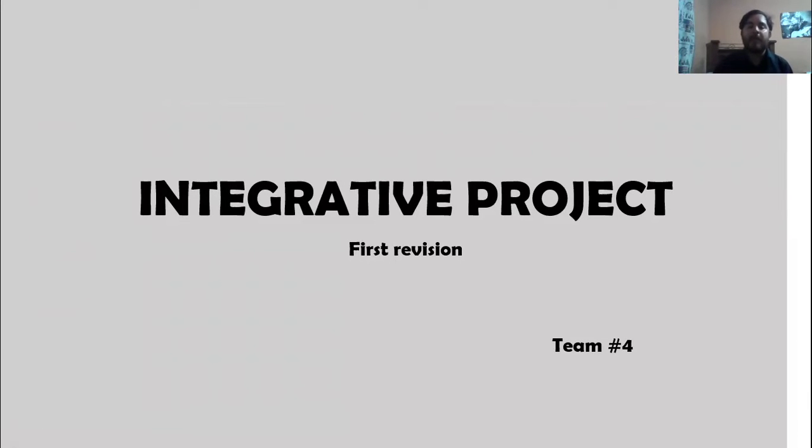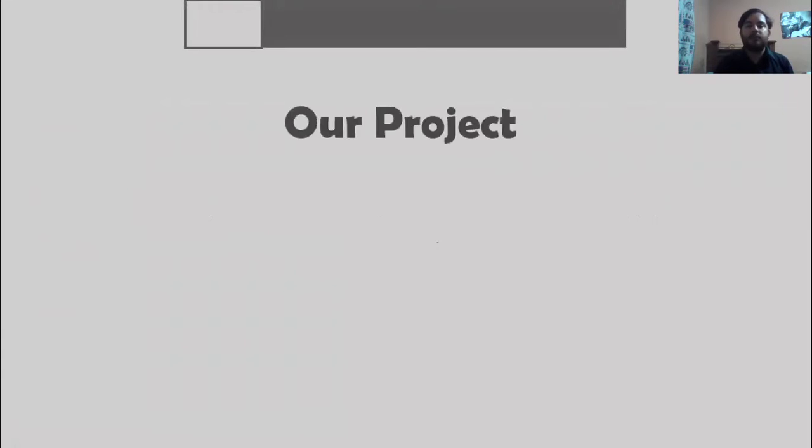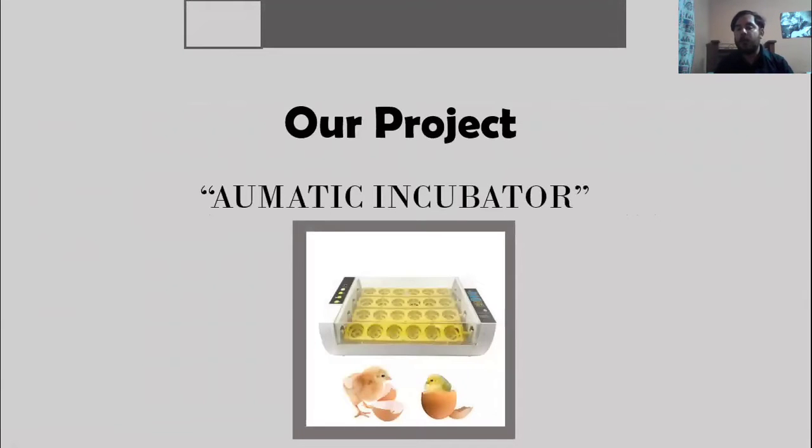Hello everyone, my name is Christian Mesa and I am the leader for team number 4. I want to present our integrative project. And well, the first thing that you need to know is our project is an automatic incubator.